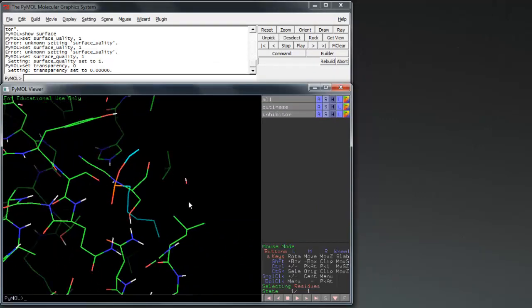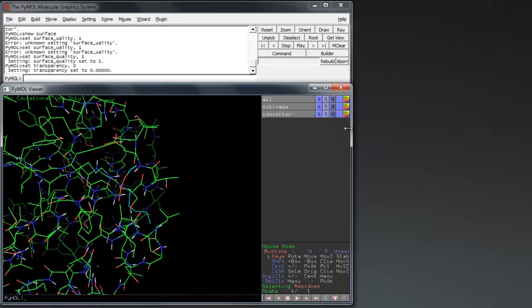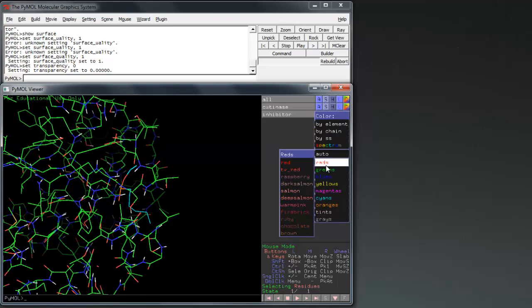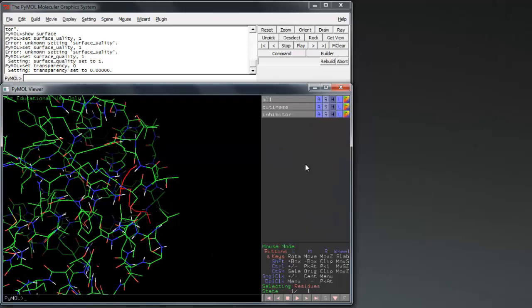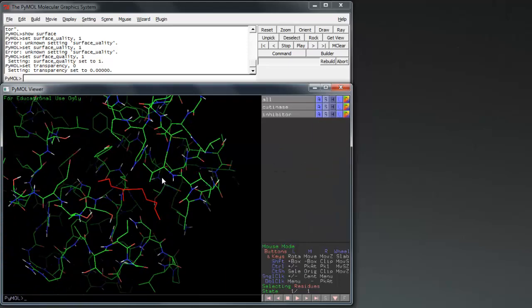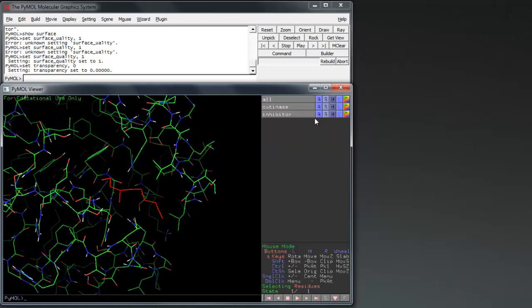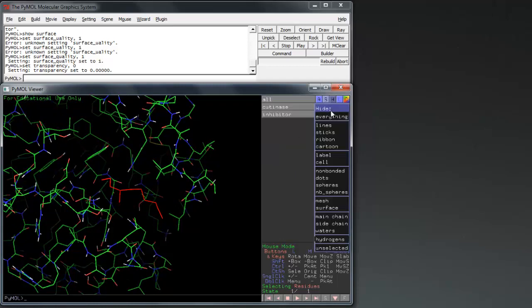I have also included an inhibitor to allow us to easily find the active site. Firstly make the inhibitor stand out by using a vibrant color, and hide the main chain of the protein as we are going to be mutating a side chain.